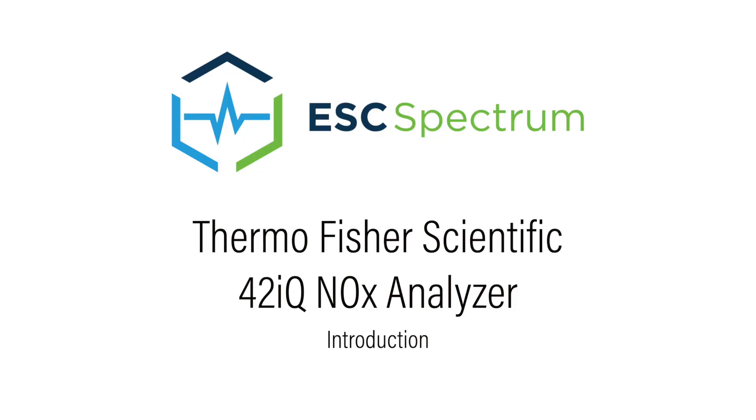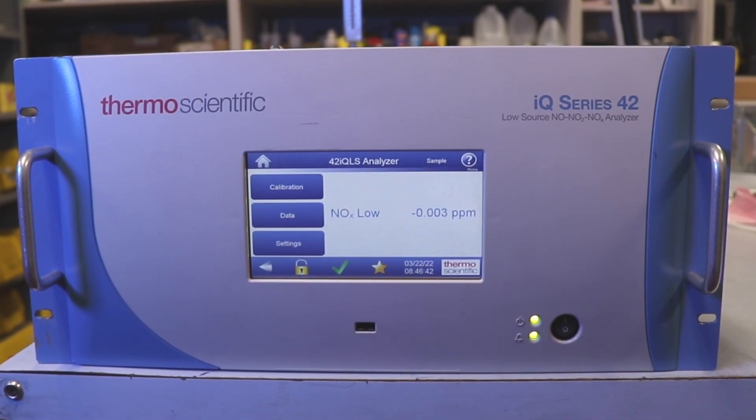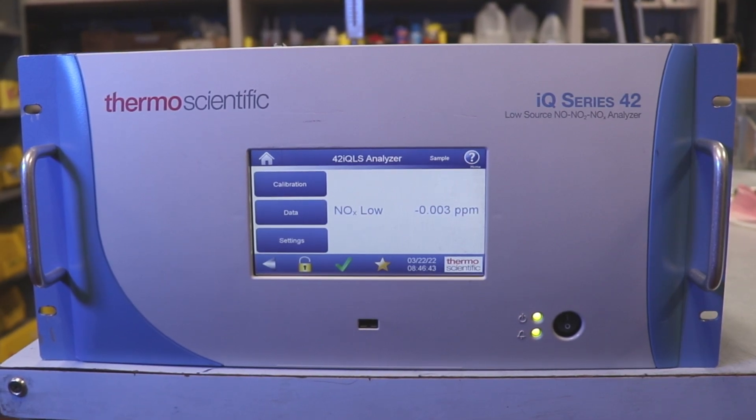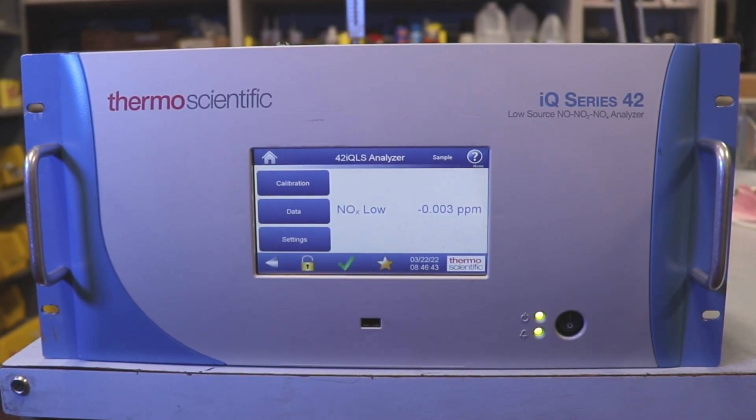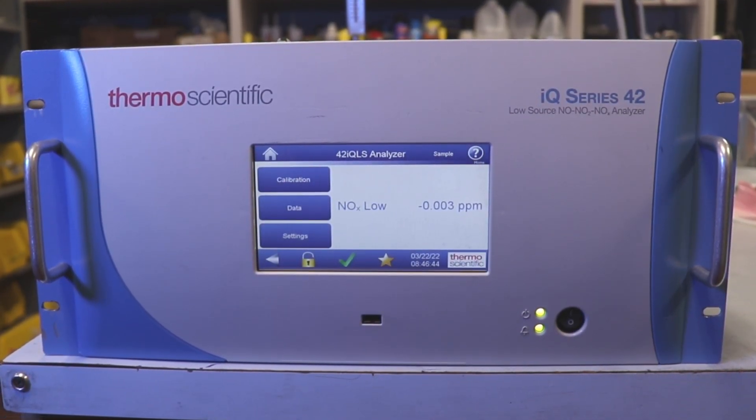In this video, we will discuss the Thermo Scientific 42iQ NOx Analyzer. Upon completion of this module, you will have a basic understanding of the theory of operation, the ability to identify all major components, and the tools to perform recommended preventative maintenance.